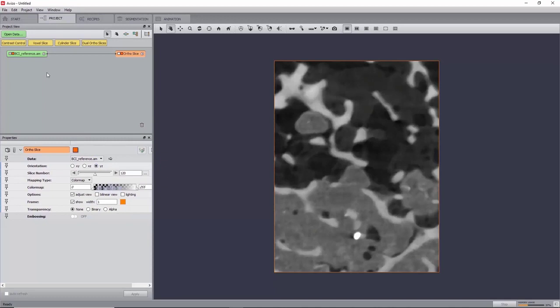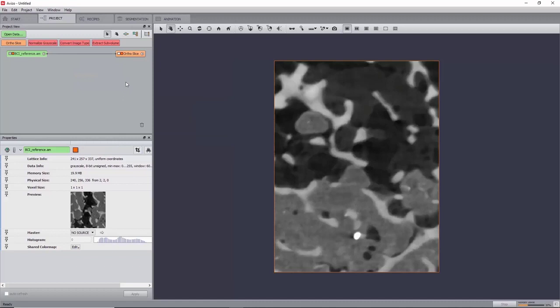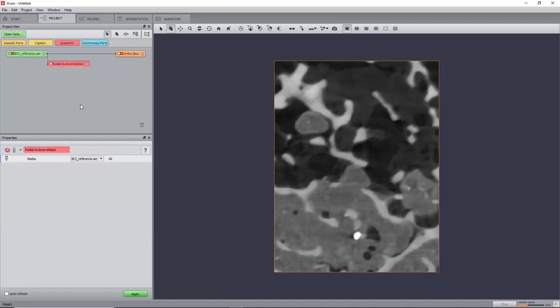Before going on to performing the DVC calculation, the microstructure's characteristic length can be studied. For this, create a radial autocorrelation module under reference and apply it.